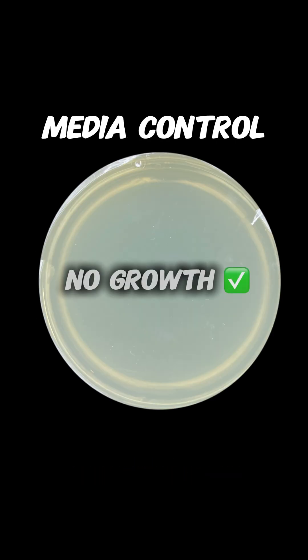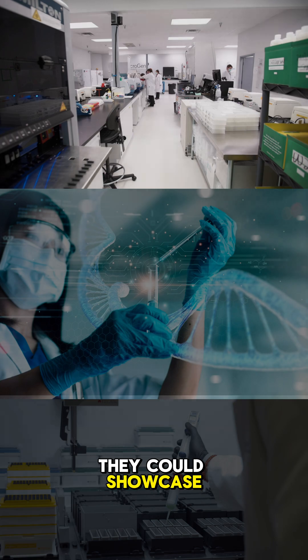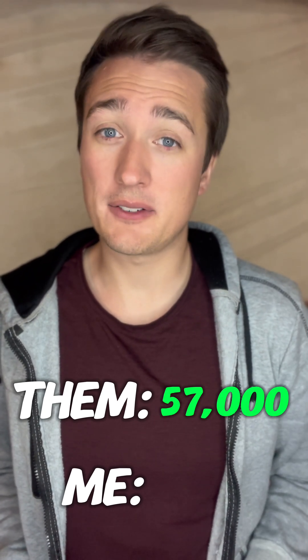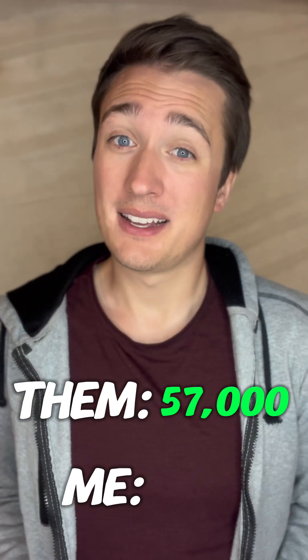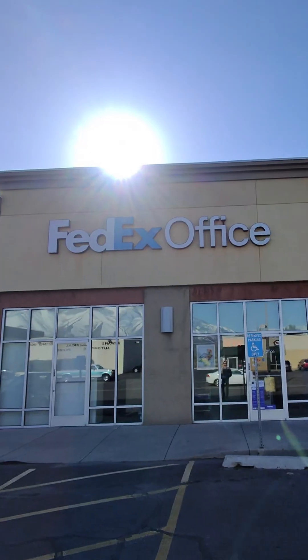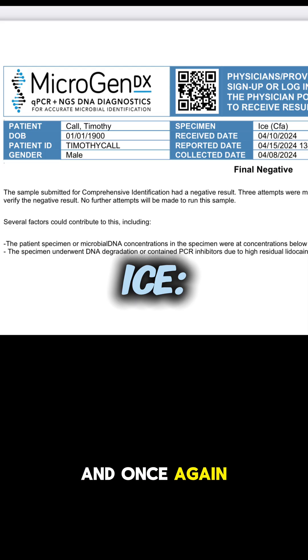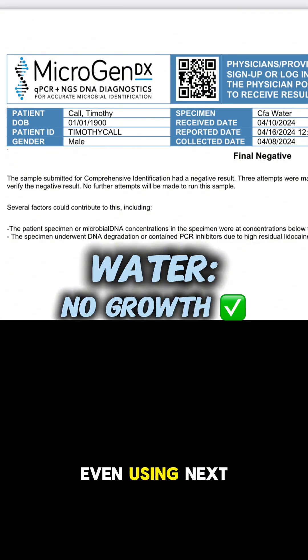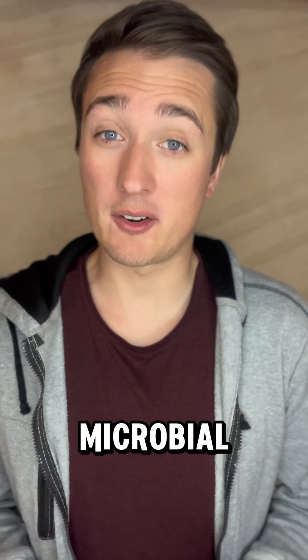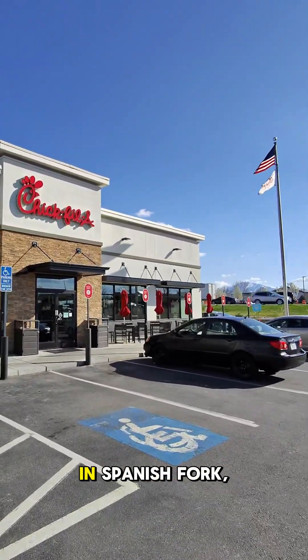Next generation sequencing is a microbiology test that can catch anything a petri dish might miss. I had a company called MicrogenDX reach out to showcase their next generation sequencing abilities — they're able to correctly identify 57,000 different bacterial and fungal species, which is about 57,000 more than I can identify using a petri dish. I shipped them the four samples via FedEx, and once again, no growth was detected in any sample. This means this Chick-fil-A location is clearly doing something to prevent microbial contamination — huge shout out to the Chick-fil-A franchise in Spanish Fork, Utah.